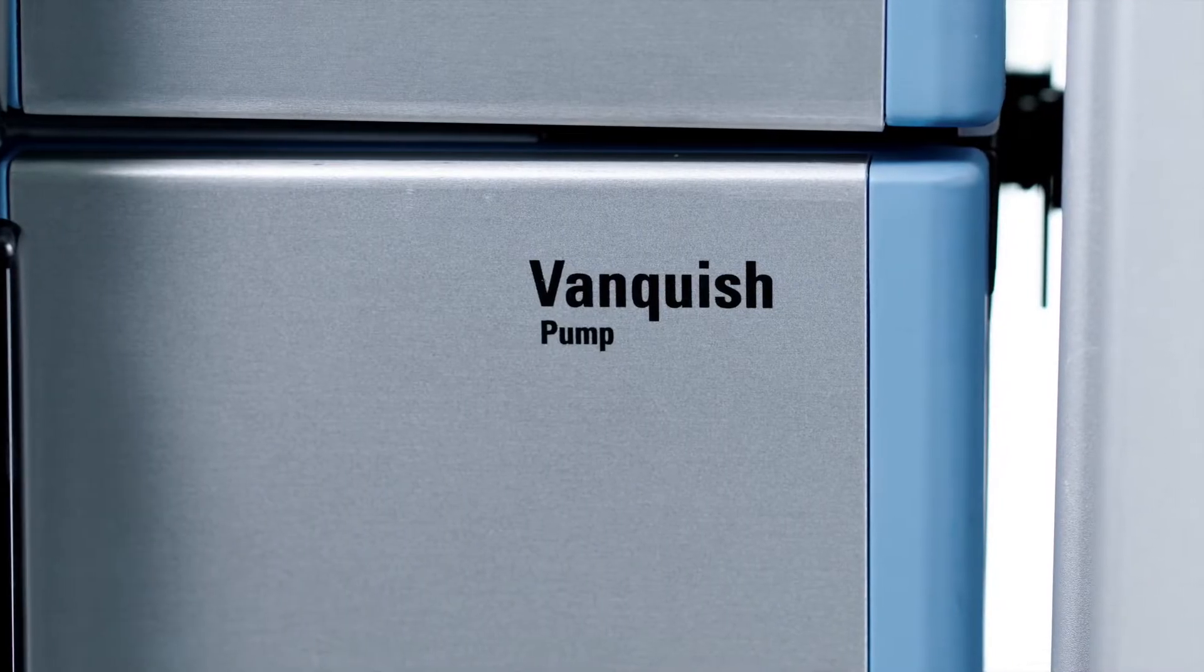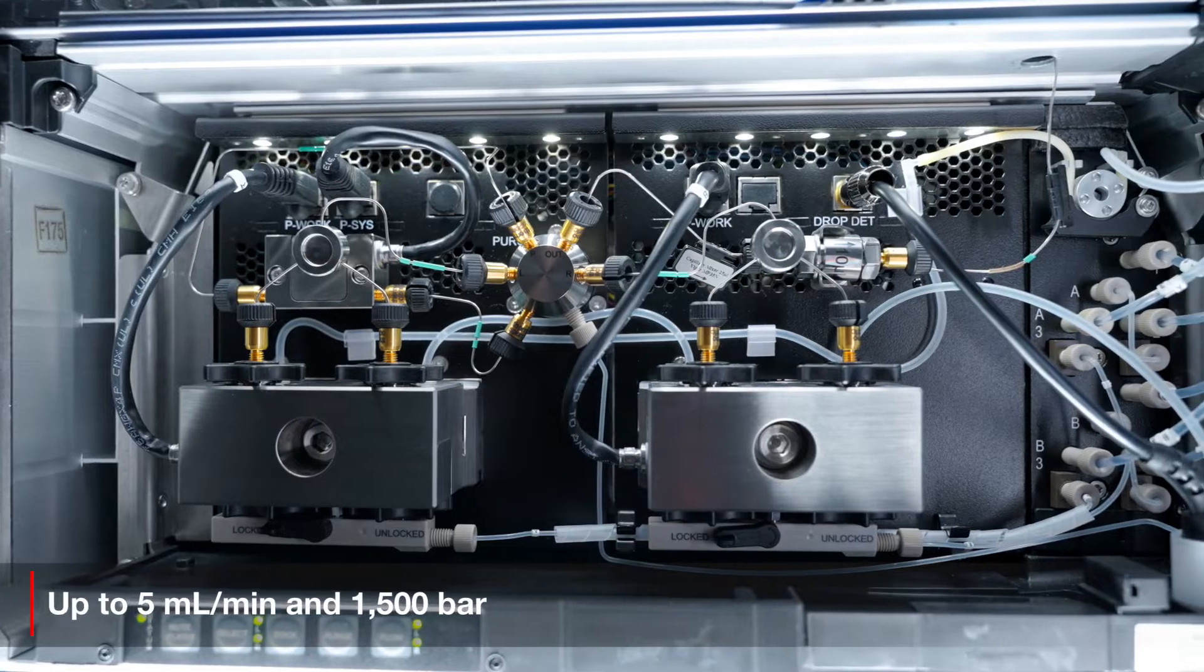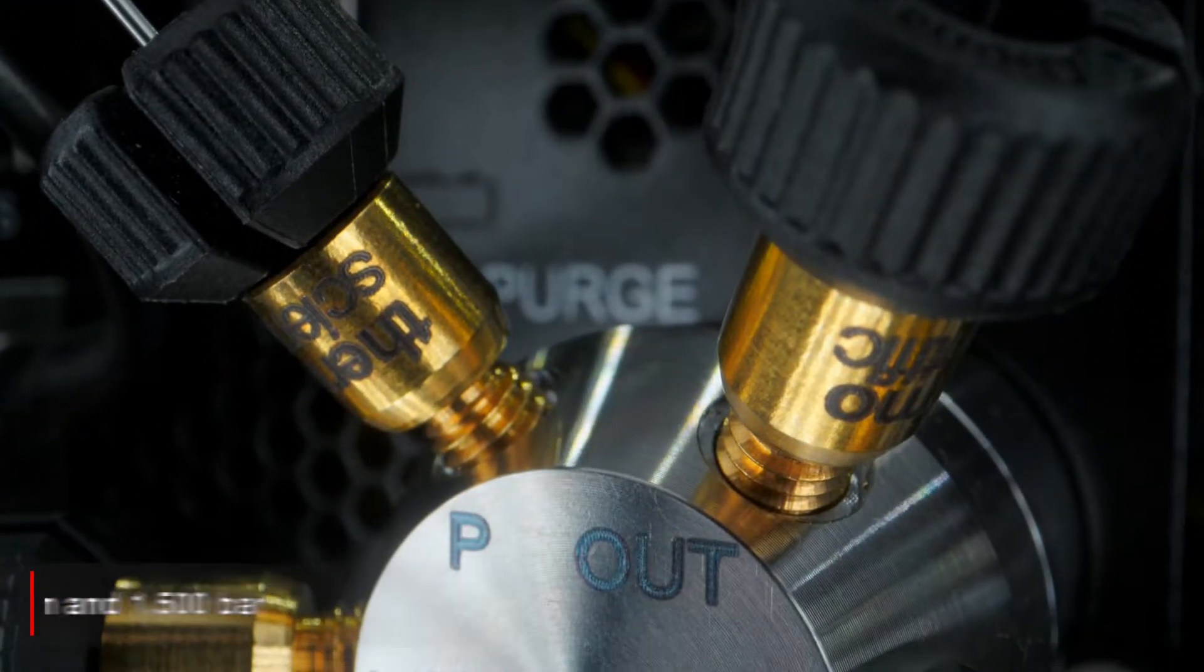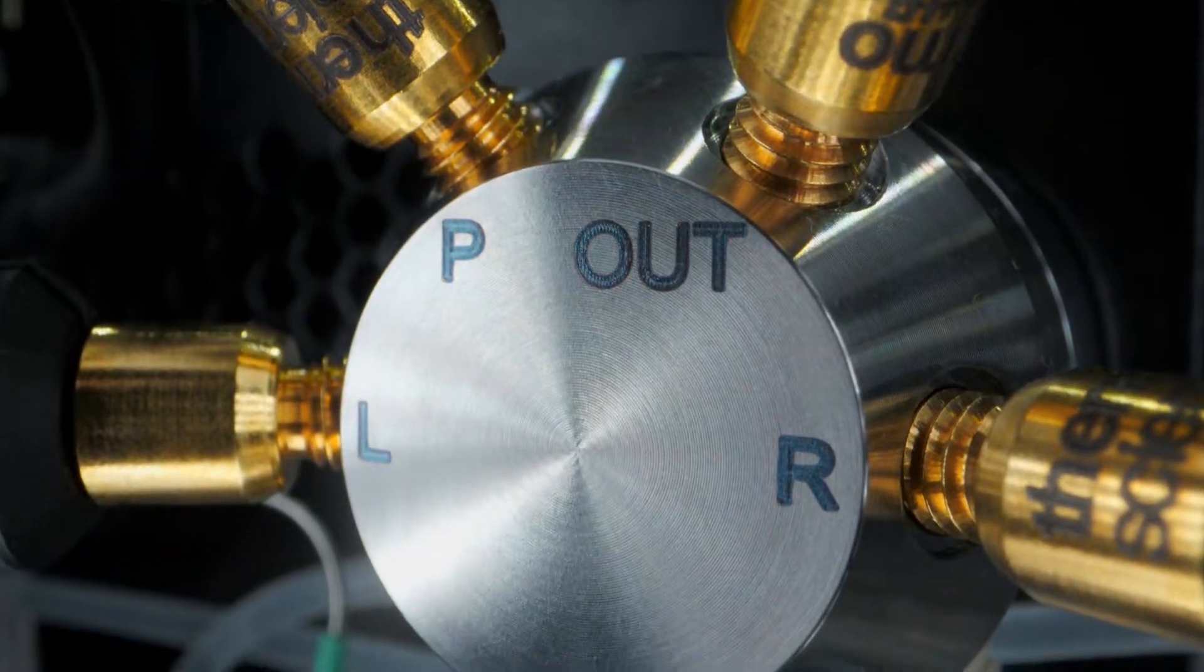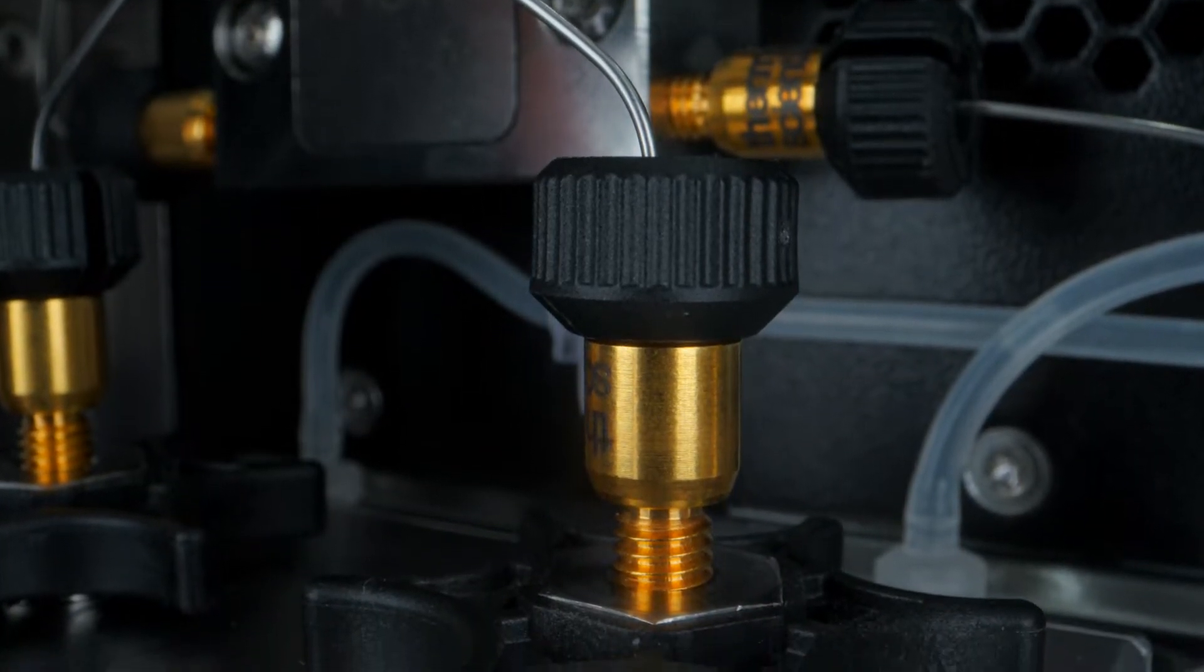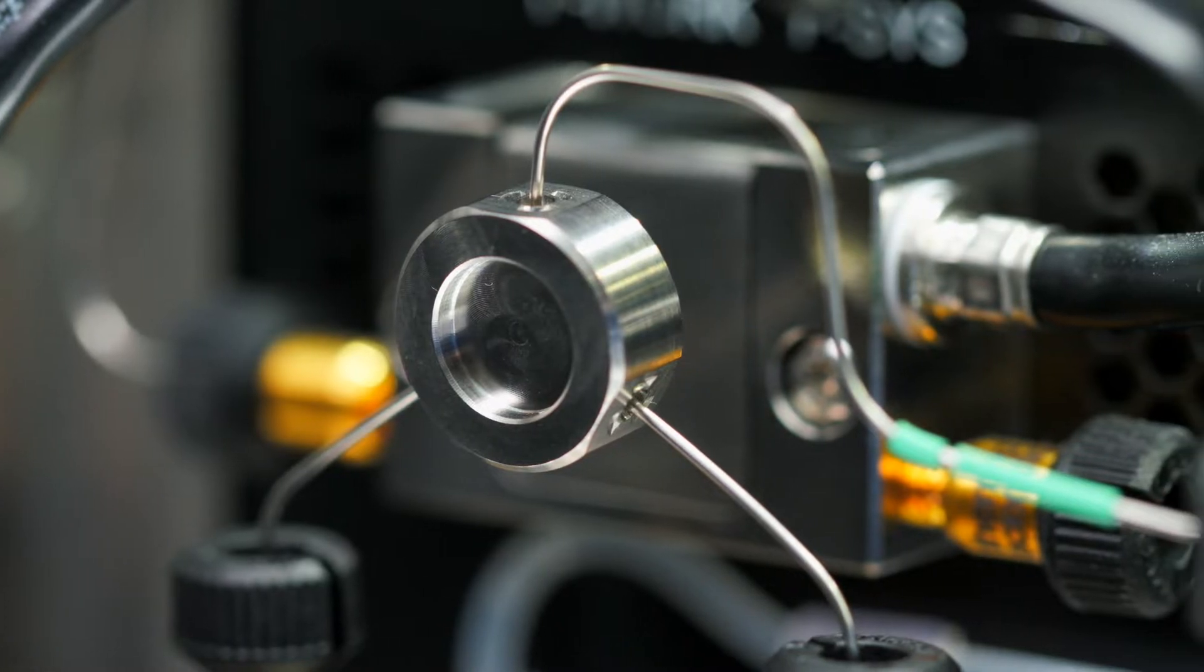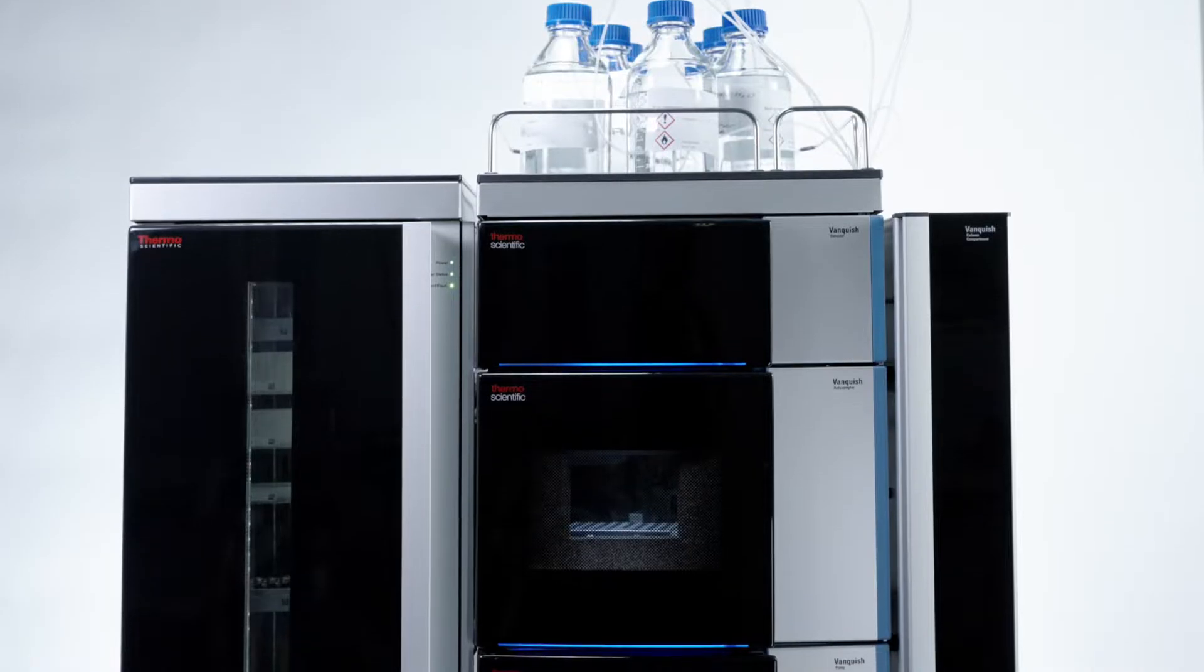The Vanquish Horizon pump with SmartFlow and SmartStroke technology delivers superior retention time precision and gradient accuracy from shallow to ultra-fast gradients. Intelligent pump stroke control enhances detection sensitivity by virtually eliminating baseline ripple when using TFA.